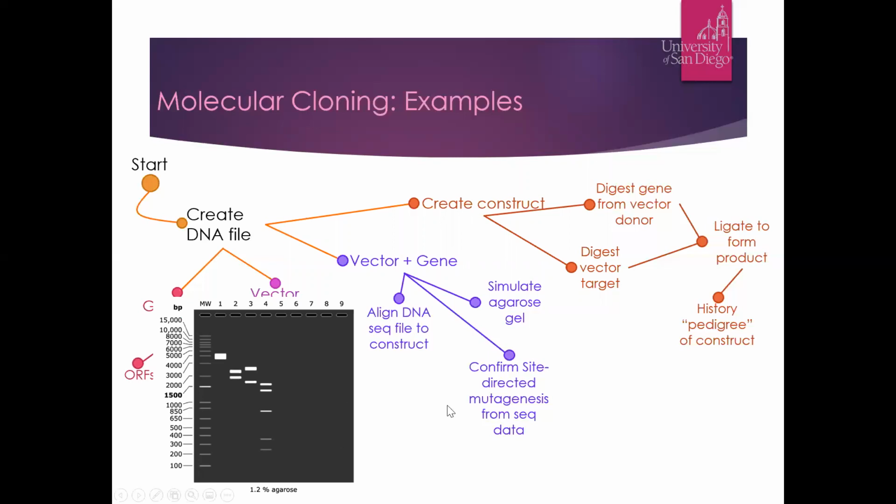So this is one way where I marry that in and kind of prep them for if they're doing restriction enzyme digest in the lab. Here's a way for you to see your potential results before you get to lab, so that you know what you should see on your gel, and if you don't, how to troubleshoot and figure that out.